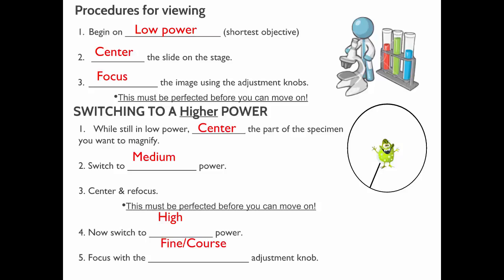Now, a couple things. In these microscopes, built into the eyepiece is a pointer. It looks like a needle. When you look in there, it's supposed to be there. You use that so you could point something out to somebody. You could rotate it around and say, okay, look right where the pointer's pointing, to point something out to somebody who's not looking at the microscope at that time.